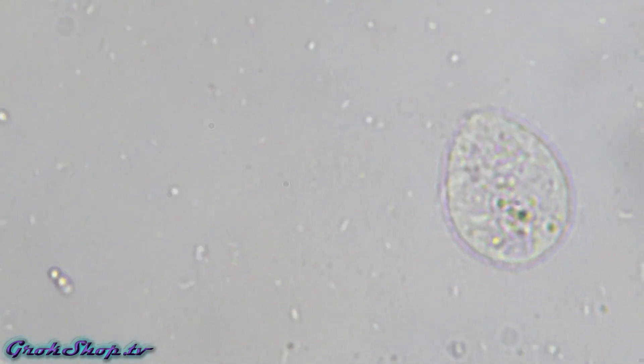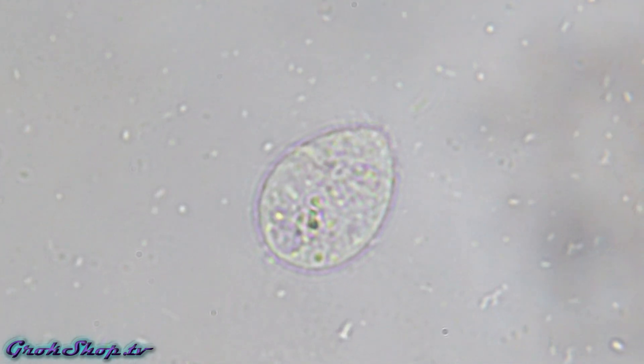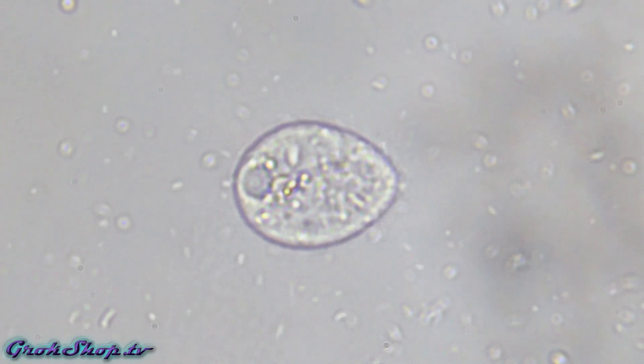There's a big fat ciliate — look at those hairs. It's just working the currents, directing bacteria towards its feeding hole and living the good life.